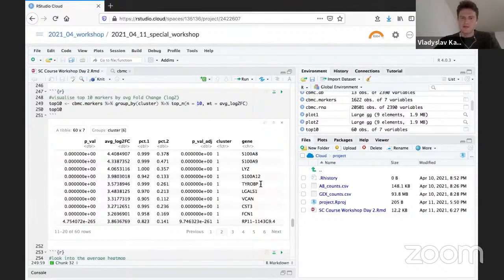So you see mainly genes that are associated with myeloid cells. It proved our theory and so on. So it can be a nice homework for you. Just walk through these genes in the output and see whether you see some patterns, whether you can describe the cell populations with the help of the genes that you see in the output. If you cannot, it's not bad.